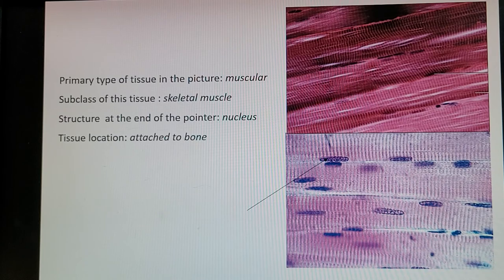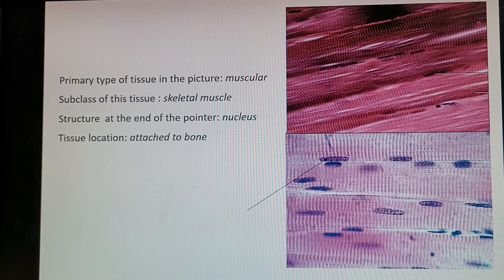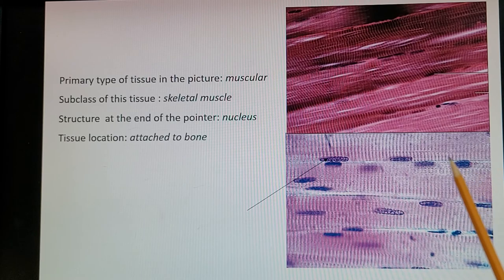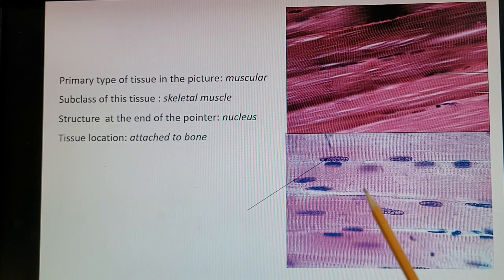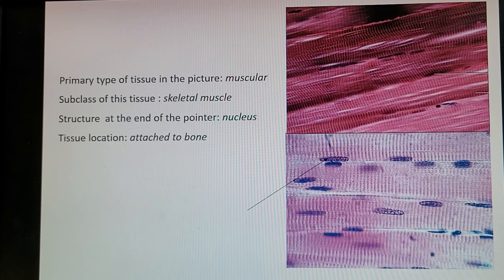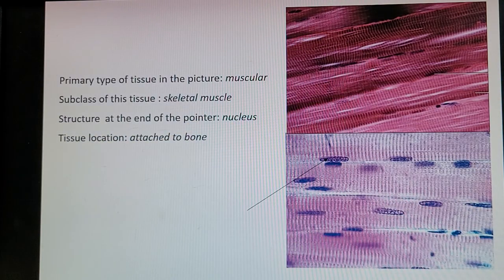Next tissue slide shows muscular tissue — the primary tissue type — with a subclass of skeletal. Skeletal muscle is striated, like cardiac, but in skeletal muscle the nuclei are multiple and located along the plasma membrane, pushed up against it. The structure at the end of the pointer (the long black arrow) is one of those nuclei. The location of skeletal muscle is attached to bone, so when it receives a command to contract, it moves the skeleton.